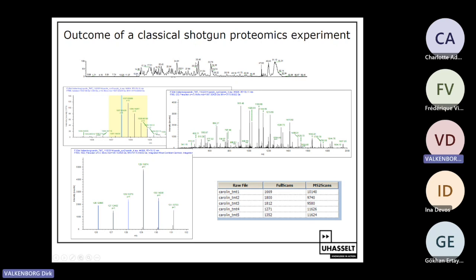We don't know yet which mass is underneath this chromatographic peak. There could be more even under this peak. We don't know that. That we need to further investigate. But this is how a chromatogram would typically look like. And you can see also very typical, like a heavy bulb of stuff that elutes at the end of the experiment. That's when we are rinsing our column with a very oily liquid phase, so that we are cleaning our column from the peptide content.